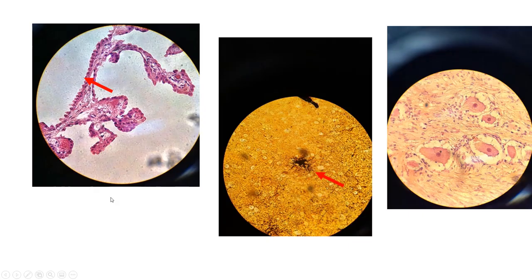Moving on to some microscope slides. These are ependymal cells, and this network of cells is called the choroid plexus. Remember they have cilia, and the purpose of these ependymal cells is to produce cerebrospinal fluid. This choroid plexus is located in the ventricles of the brain and central canal of the spinal cord.